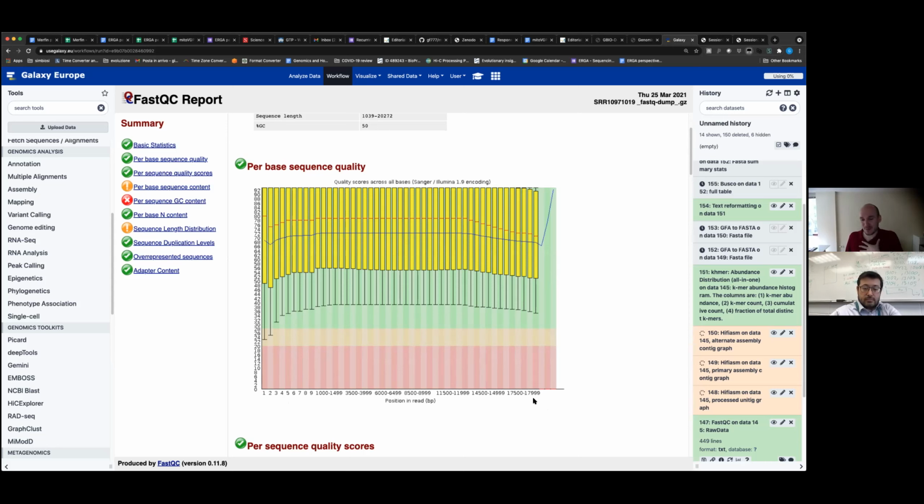But here, I think it's really confusing, because you have the impression that this counts as the rest, but it doesn't. Anyway, here you have the quality score. It's based on the position in base pairs on the read, and of course the first 10 are not going to be as good an average as the rest.